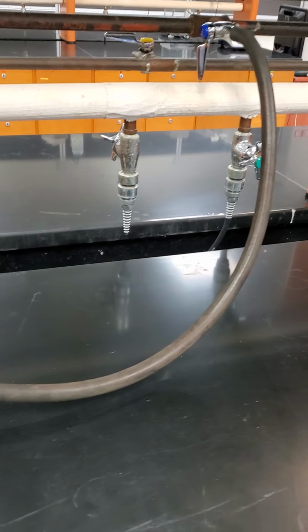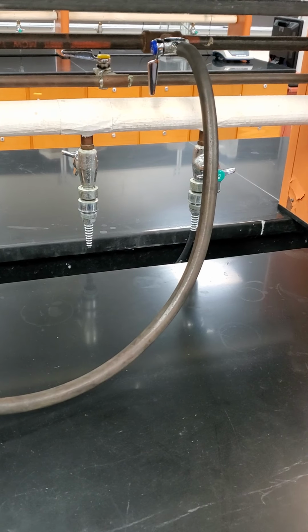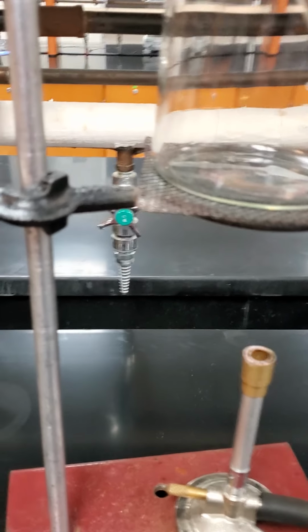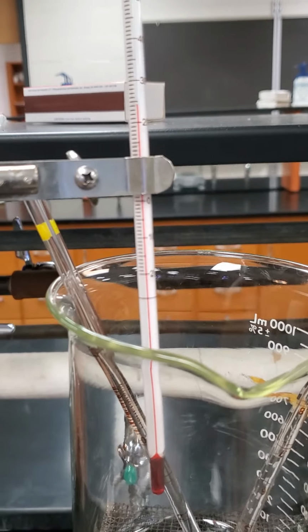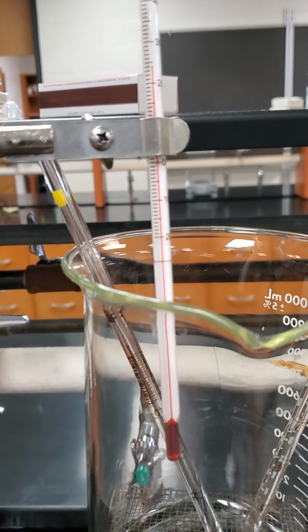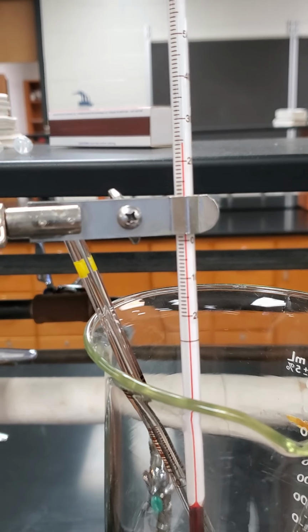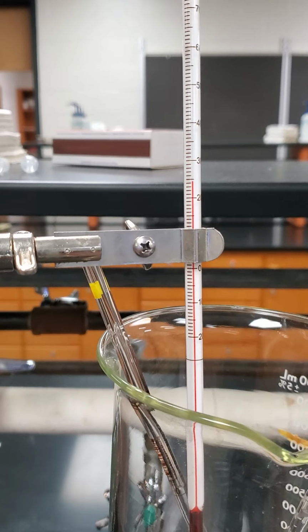And remember, I'm allowed one more digit that I can actually measure, so I'm going to say it's 0.681. Then I'm going to set it in this 1 liter beaker, and I have a thermometer in there as well. The thermometer says 24.5, we'll say. Those are the initial conditions.